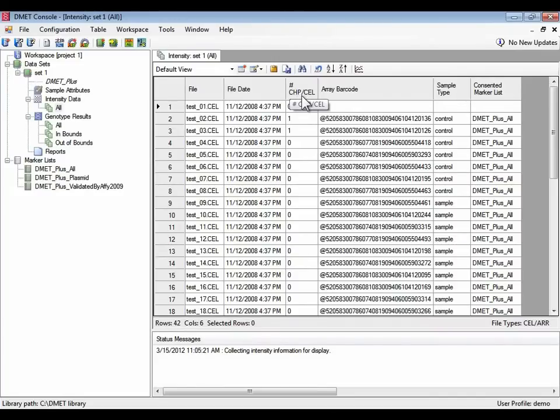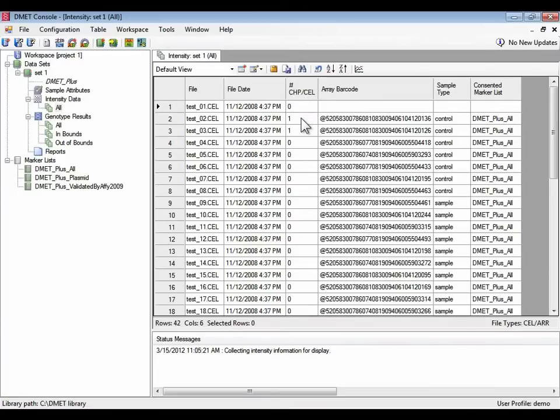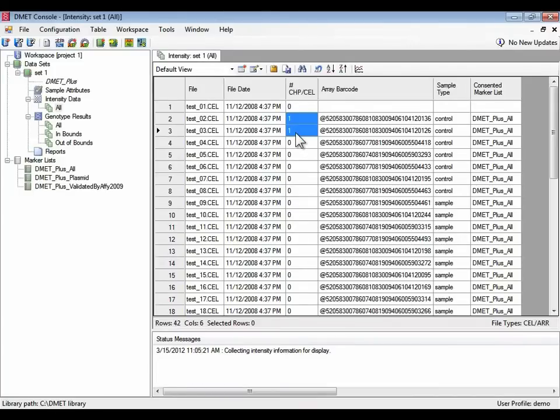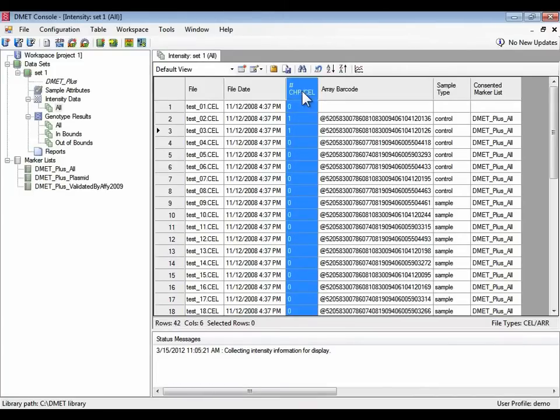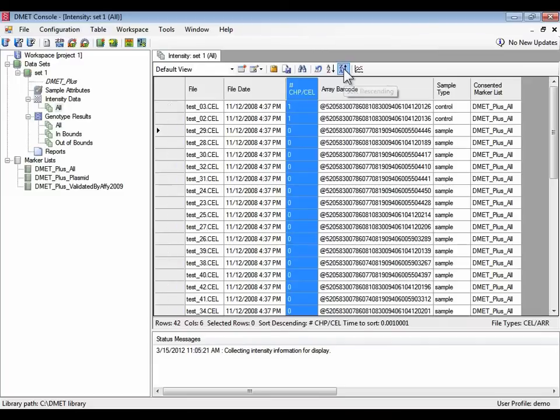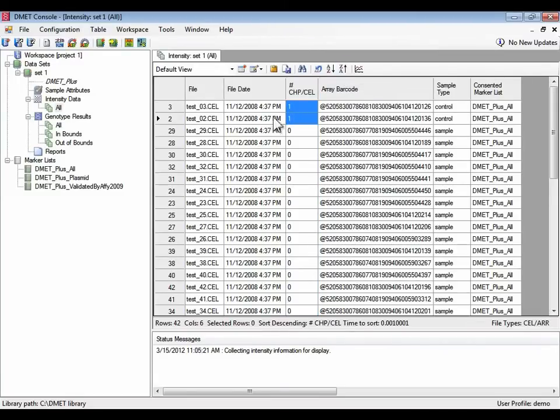In this case, the relevant column we're looking at is the number of chip files per cell file. In other words, the number of genotype result files for each one of these files. We have two cell files that have results files already. I can sort on this to see that yes, they are the only two files that have been processed. And then the rest haven't been genotyped.